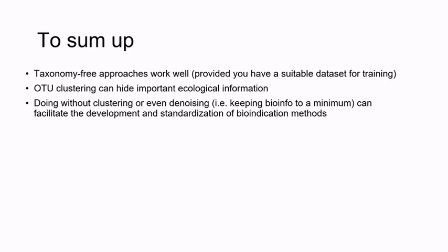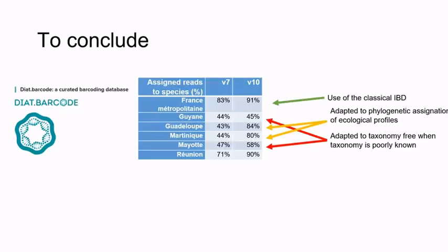But one day, we will also have to standardize the bioinformatic pipeline. The idea was to have the minimum to standardize and not a too complex standard. Can we simplify the bioinformatic pipeline in order to have a simple standard? And this was the idea of trying with ISU without denoising.